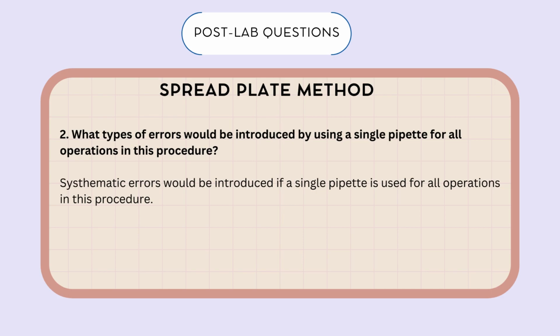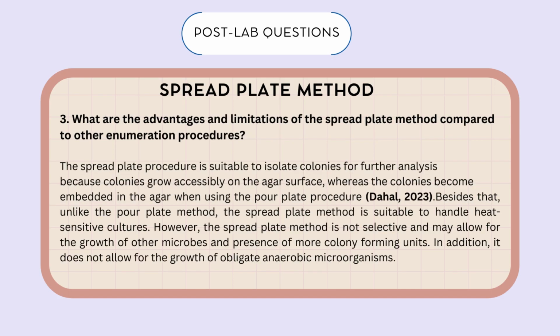What types of errors would be introduced by using a single pipette for all operations in this procedure? Systematic errors would be introduced if a single pipette is used for all operations in this procedure.